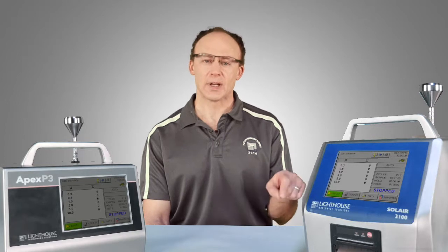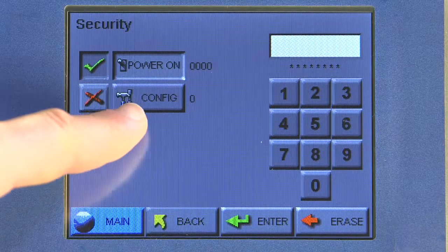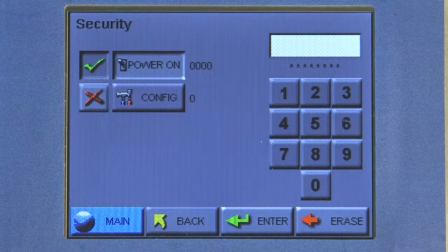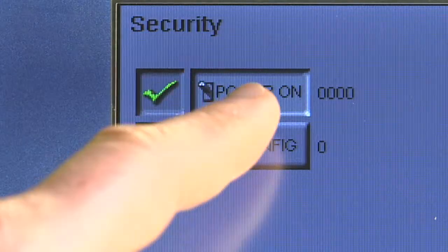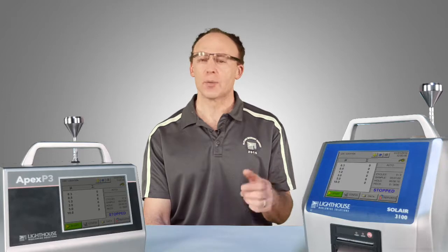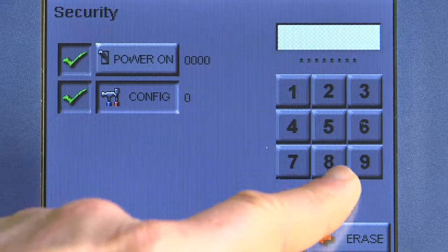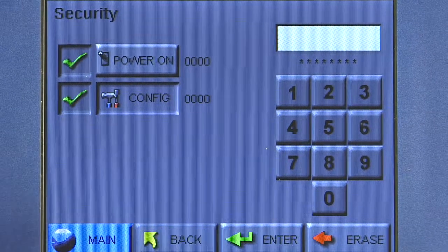Next is my configuration password. If I enable my configuration password and I want to reconfigure my instrument — say I want to change my sample time, hold time, or alarm limits — I'm going to be required to enter a configuration password. Let's keep it simple and do one zero zero zero zero, then Enter.